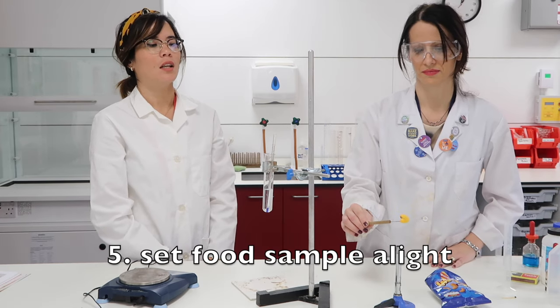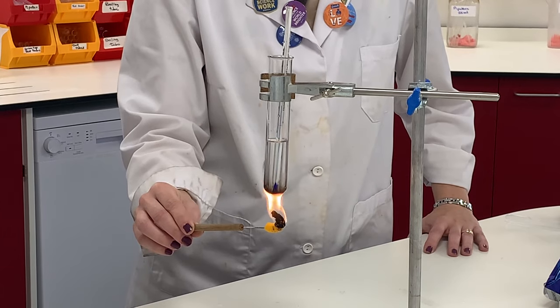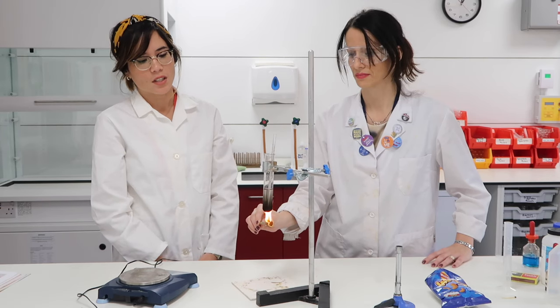It's quite warm in the lab so our starting temperature is 22 degrees Celsius. The next step is to set our food sample alight using a Bunsen burner. As you can see, the mounted needle is used to keep that burning Wotsit away from your hands.